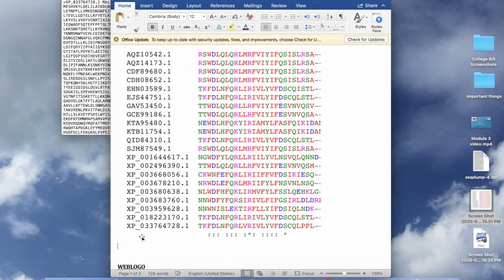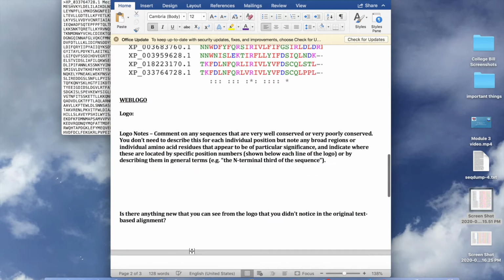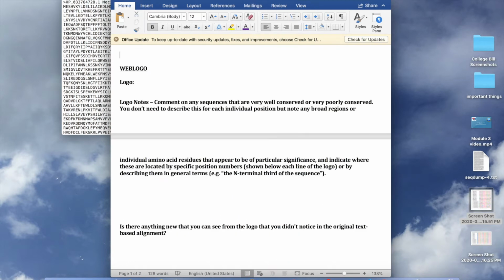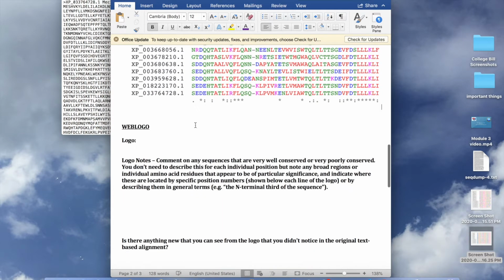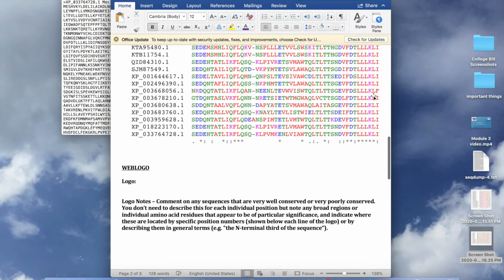And we'll do that one. There's a lot of asterisks. And place that in as well. Alright, so now I think I'm all set to work on the WebLogo.